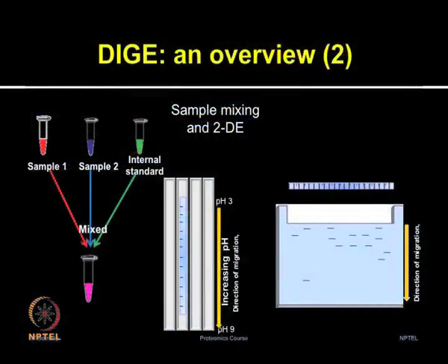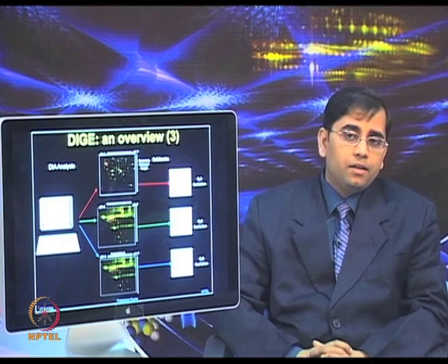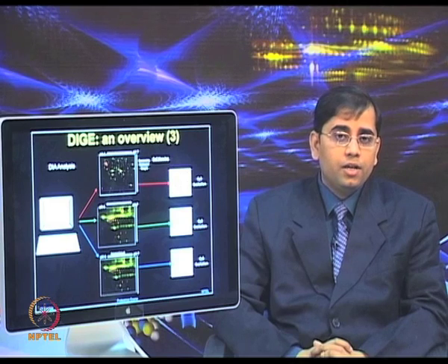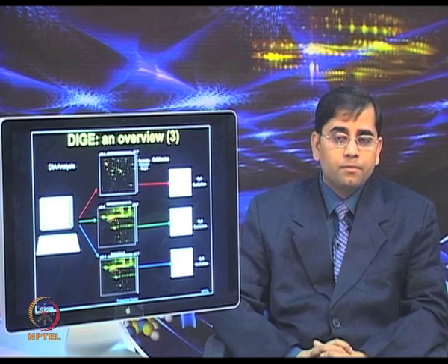So, in the slide it is shown that the 3 samples are mixed and then isoelectric focusing is performed from the pooled sample, and then this strip is placed on the SDS-PAGE gel for the protein separation in the second dimension. So, overall DIGE provides very uniform staining from gel to gel and shows high sensitivity and a linear dynamic range of detection for the expression profiling of complex biological samples.